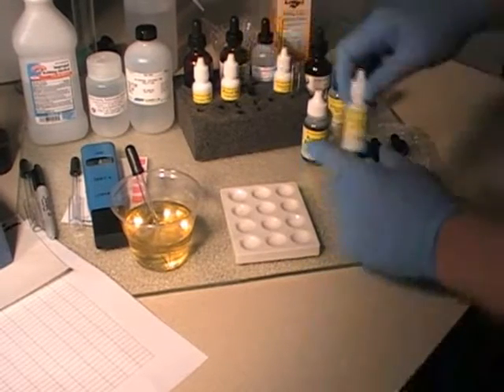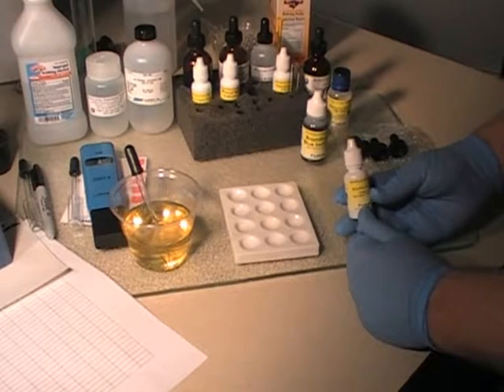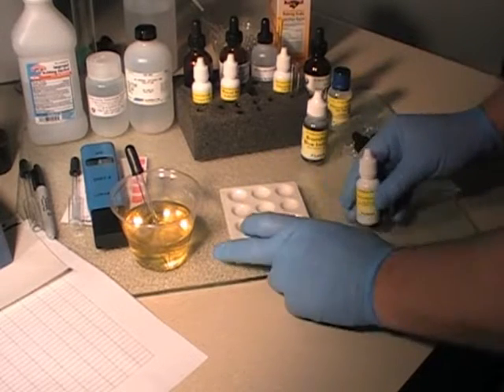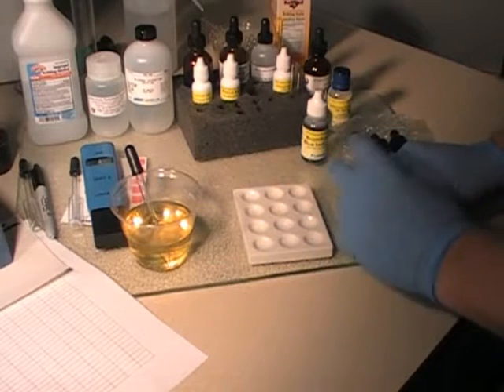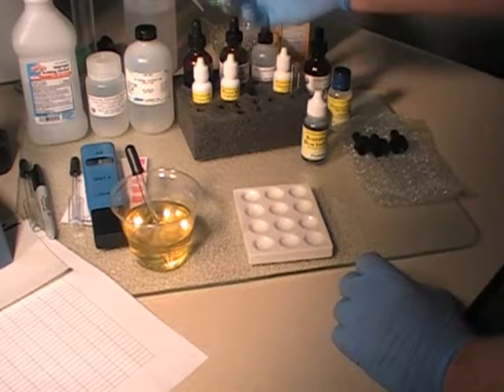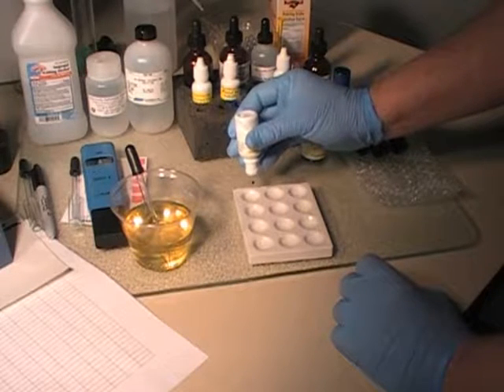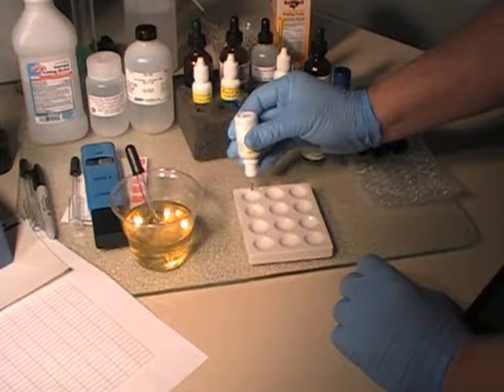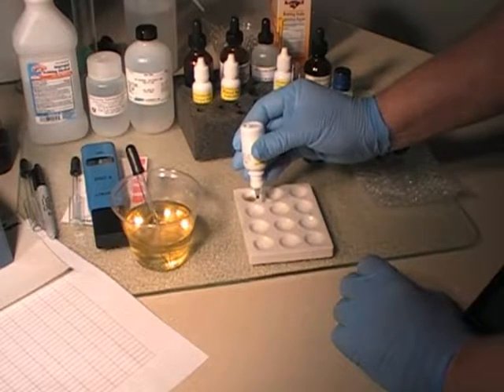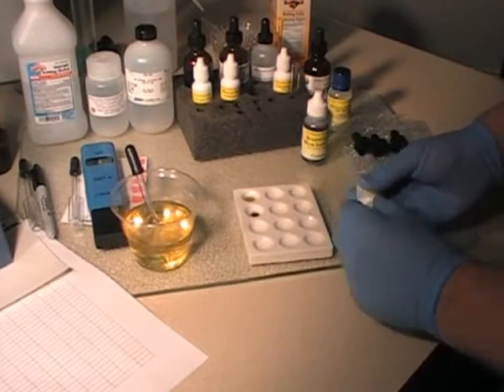Okay. We will first use our bromthymol blue to test the first drop of urine and the first drop of saliva. And you'll see why we put a drop of each in the next two afterwards, depending on what we see here. So what I like to do is shake it a little bit and make sure that it's coming out nicely, and you just let it drop right into the well plate. And look at that. This person's got a nice color pH. And so we put one drop in each.